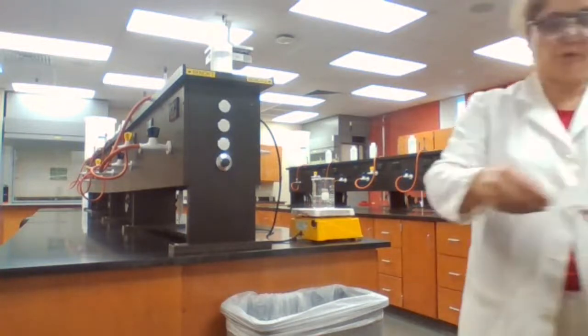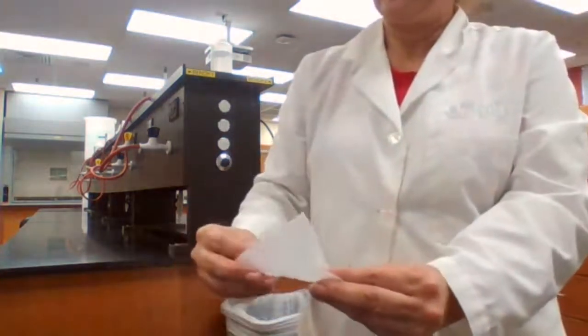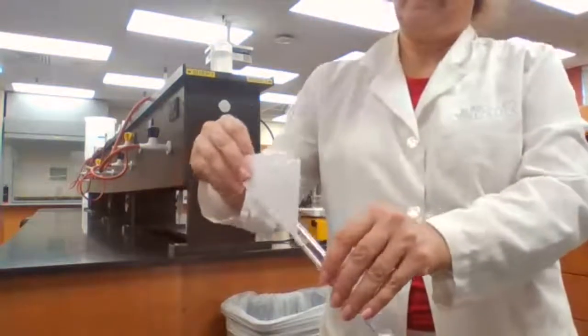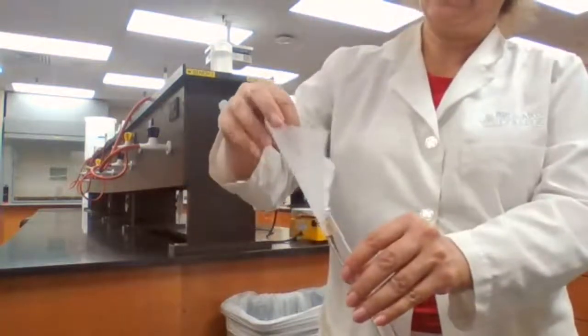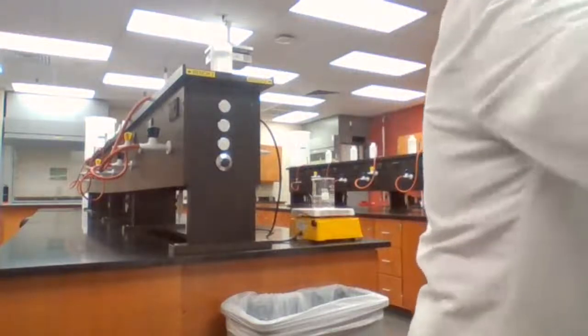I measure the 0.5 grams on weighing paper, and I'm going to make a funnel and transfer the salicylic acid into the test tube. Add 3 milliliters of methanol.